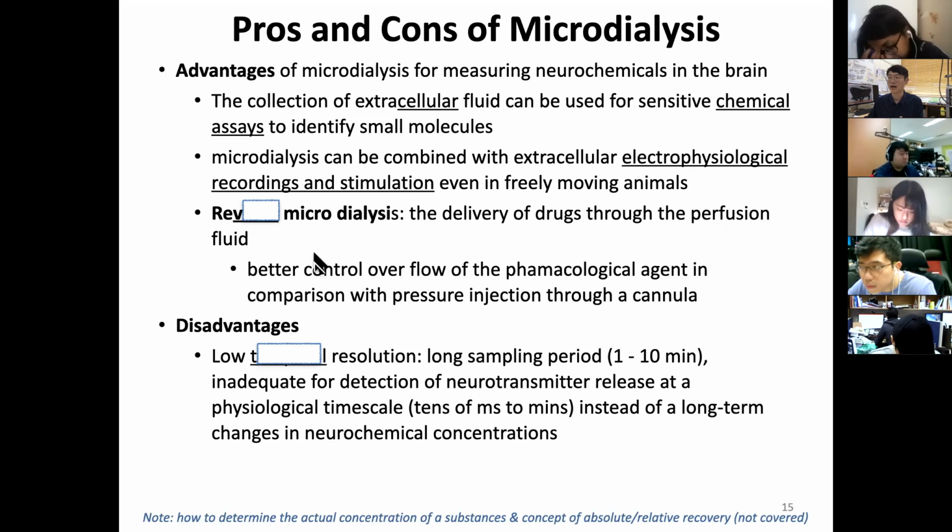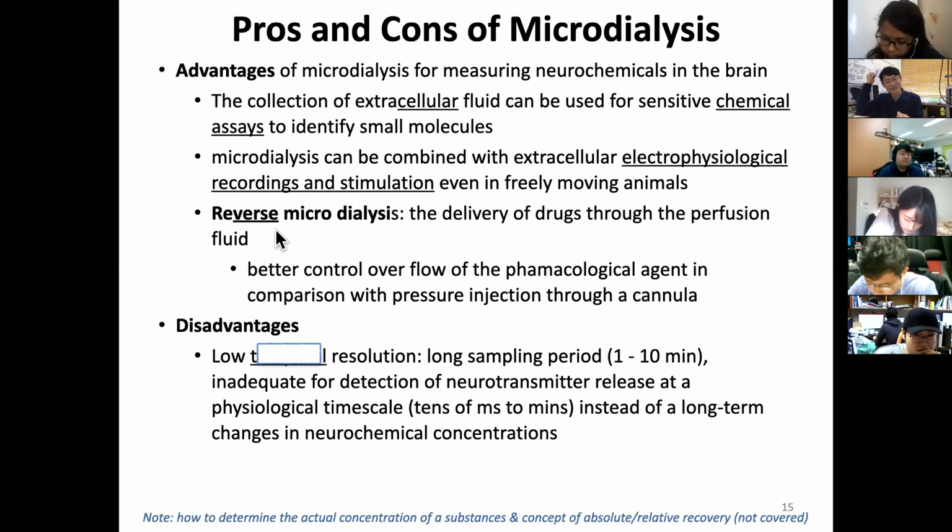And Yang Euna, can you guess what this is? Sorry, not sure. Okay, yeah, this is just the opposite way of microdialysis. So it's reverse microdialysis. Because original microdialysis is you just collect, now you give them a drug, okay? And so far so good.